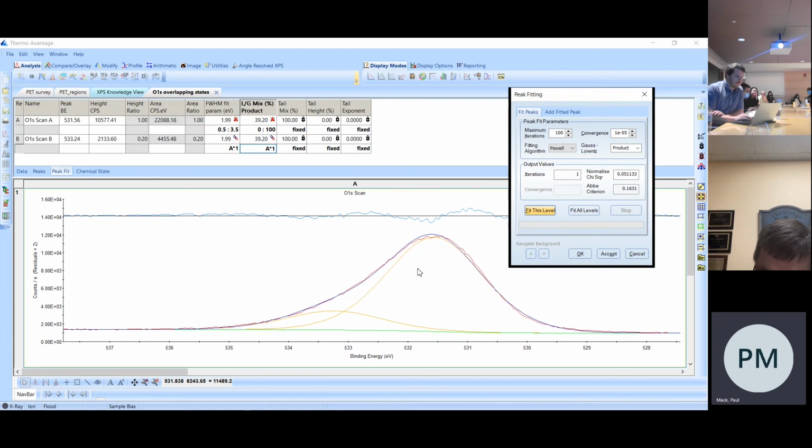So as we saw in the knowledge base, though, it is possible to fit the spectrum in different ways with different widths. But what we're saying here is the resolution of this peak is not good enough to give you the information about the relative shapes, the relative width. So by using this procedure, where initially you try and fix as much as possible, this procedure stops you fitting inappropriately. It stops you trying to allow too much variation in your peak fit. So you should always begin by fixing as much as possible.